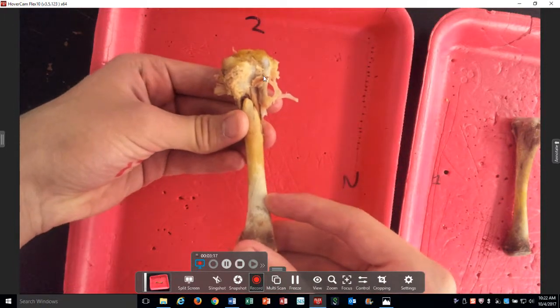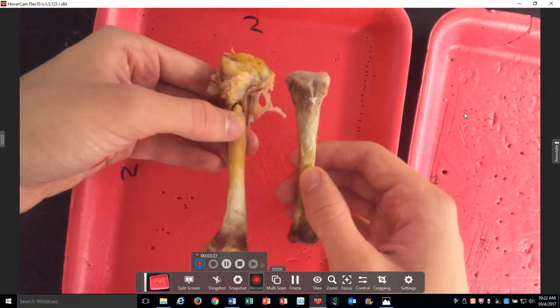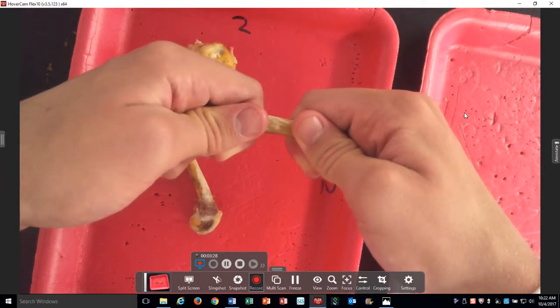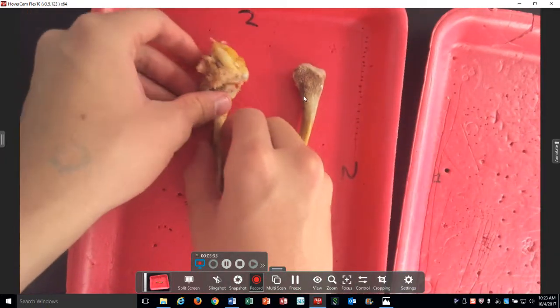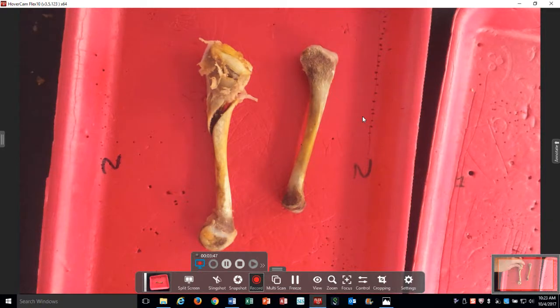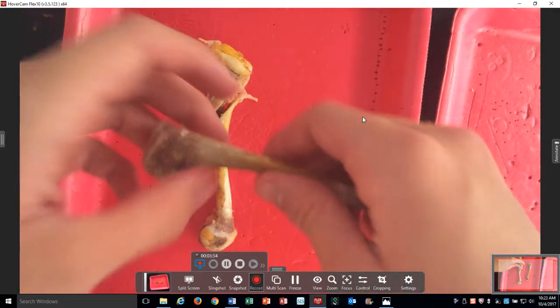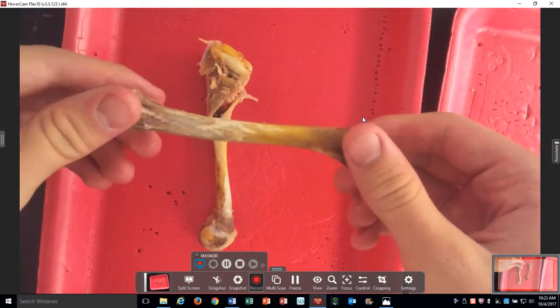You can see the break — we can actually revisit this and talk about a certain type of break. Grab the other one and give it a firm squeeze — don't break it. He could break it, but that's pretty firm. What's going to happen is we're going to mass these out, and then I'm going to soak it overnight in nitric acid. After that, if he picks it up and bends it, you can actually make the proximal end and the distal end touch each other — and there's one where you can actually tie it in half.